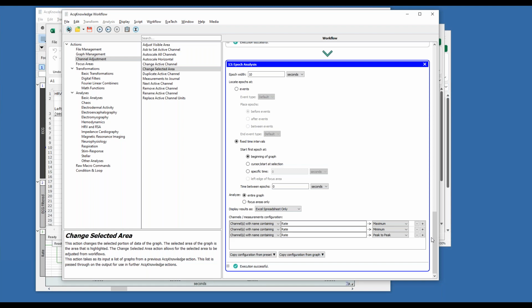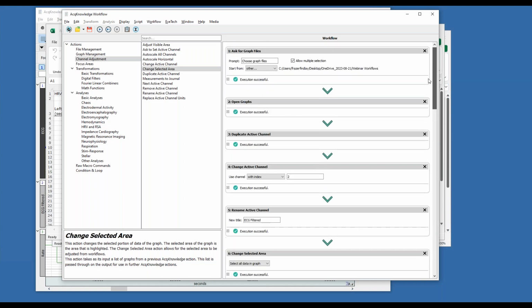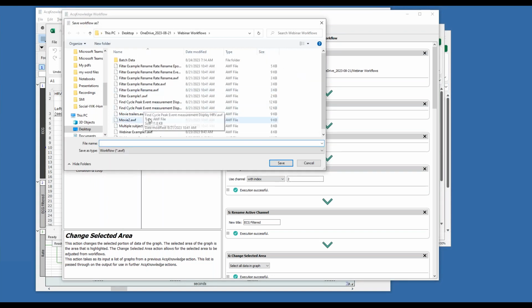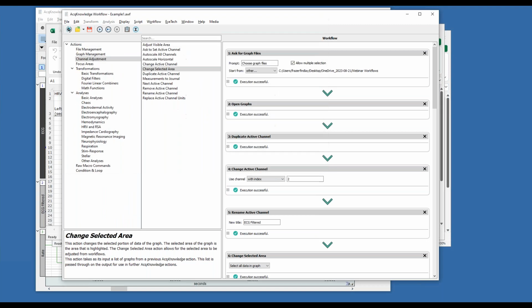tasks. And this is all done within that one workflow that we've been creating and layering on, you know, like building blocks, right? So once I've created that, I can just come in here and I can give this a label. And now anytime any of us want to use that, we just grab that, and this is configured, ready for a user based on our standardized graph settings.